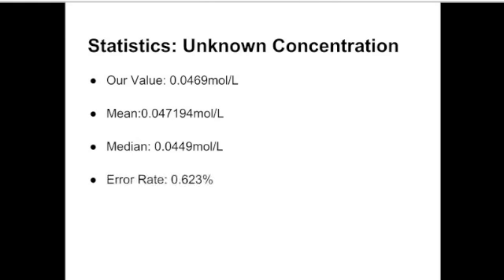Our error rate was only 0.623%, less than 1%. The standard deviation for the values of the class was 0.01017, which is a pretty small standard deviation.